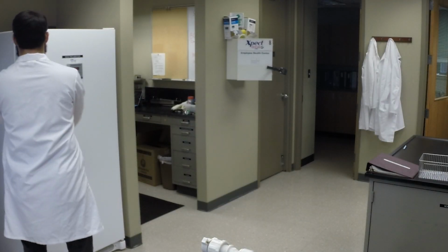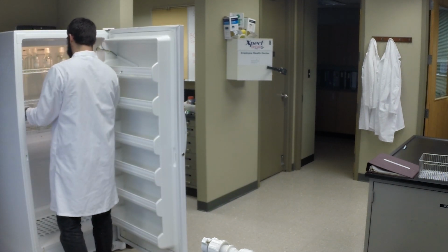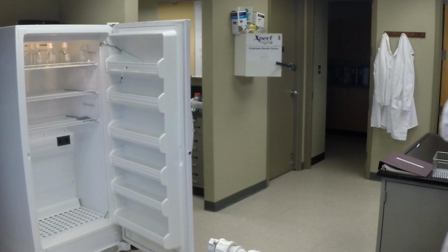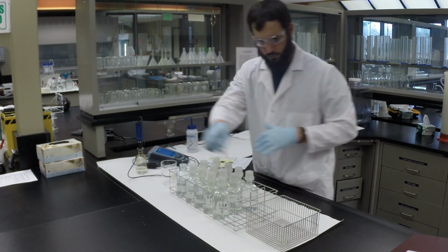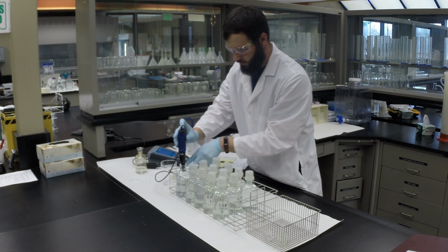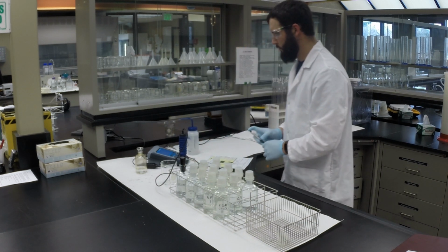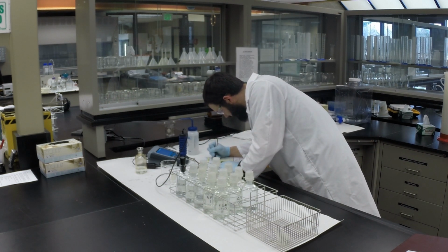Once the 5-day incubation period is up, calibrate your DO probe in the same way as you did during the initial DO readout. Record the incubator temperature, then pull out the BOD bottles from the incubator. Gently pull off the cap and stopper from your first blank bottle. Insert the DO probe without sloshing or splashing the water. Turn on the stirrer and hit read on the probe. After the probe is stabilized, record the final DO results on your BOD bench sheet or LIMS.